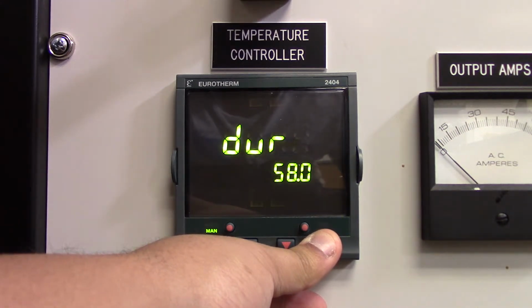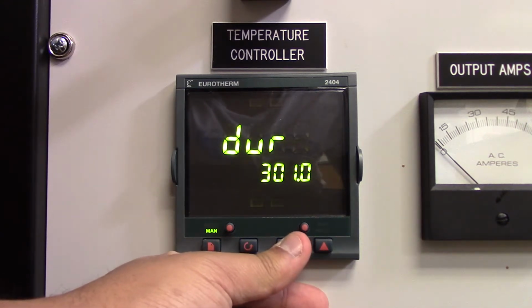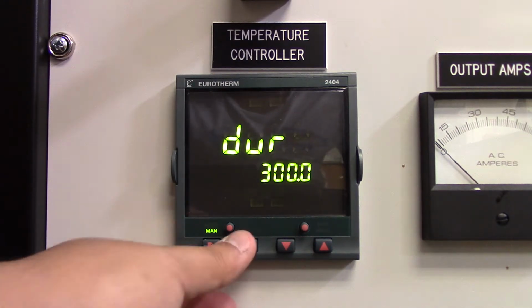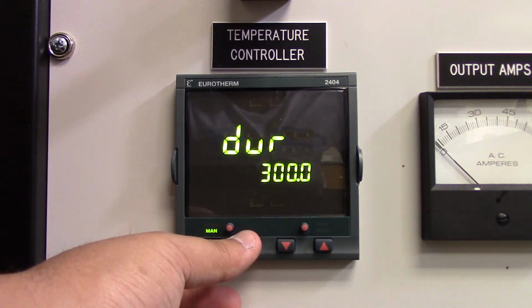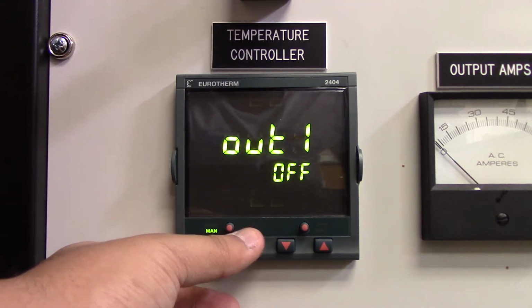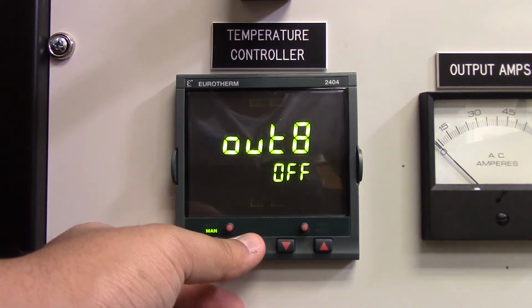Here we go, 300 minutes. Okay, nice. And we're just going to leave all of the gases off. No gases need to be on for this one.